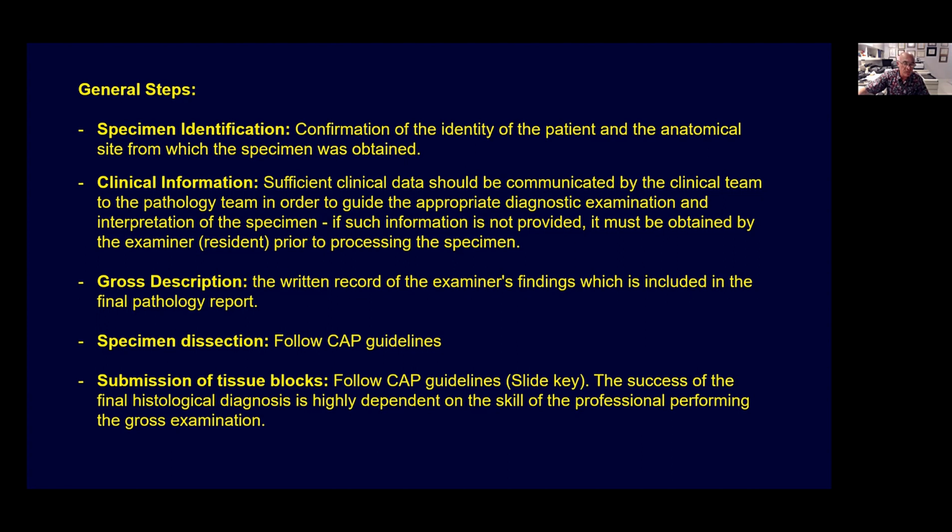So the next part is going to be the gross description. In case that we are dealing with small specimens, we are going to basically describe, if it is a biopsy, the length. In case of transurethral resection of bladder tumors, for example, I always want to emphasize, as I will mention later, that the weight of the specimen is more important than the measurement. And in those cases, we need to even document in the final diagnosis the weight of the total specimens, especially in transurethral resections, and also either for prostate or for bladder.